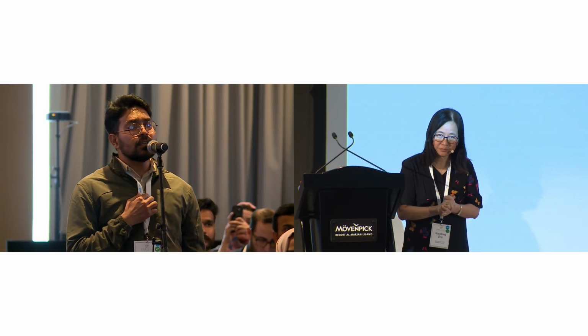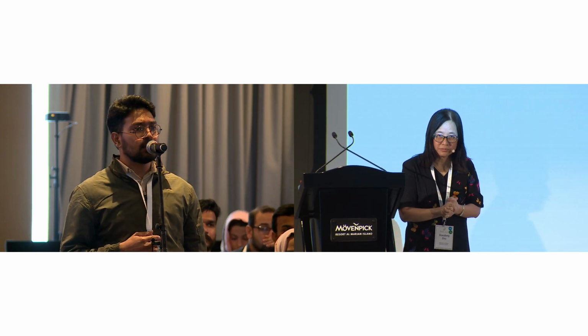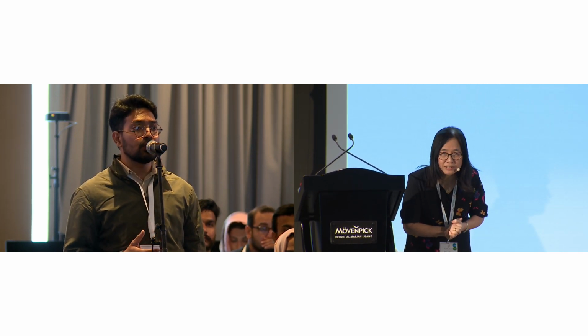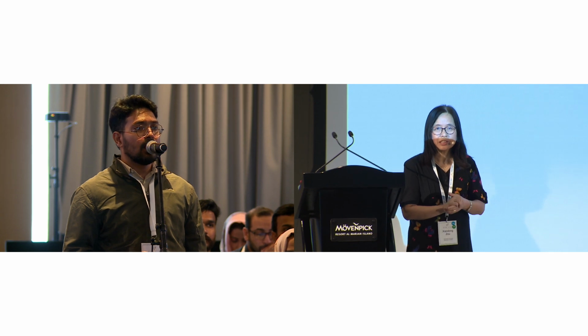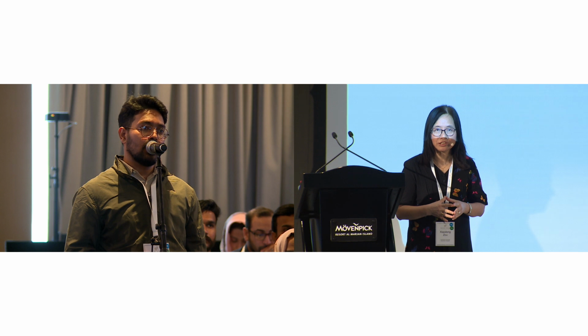Okay. Last question. Is it possible to calculate anisotropy in the material with the help of this? Anisotropy? Yes. If you have high resolution data, you can refine the structure anisotropically. Most of our structure refinements were done anisotropically because we have sub-angstrom resolution data. Okay. Till now, is there any limitation compared to XRD?